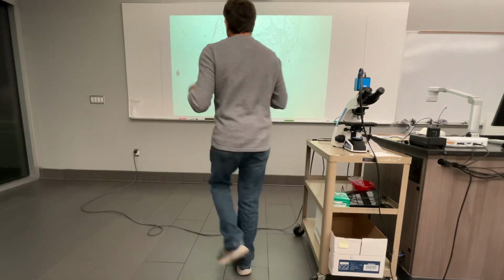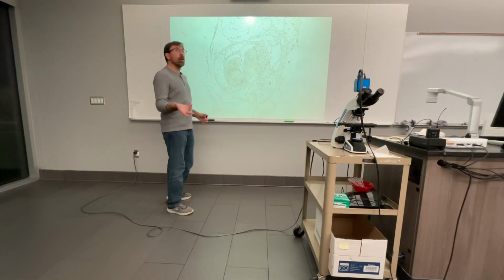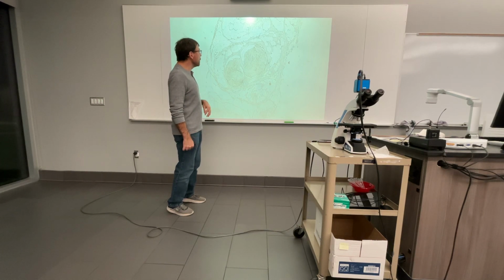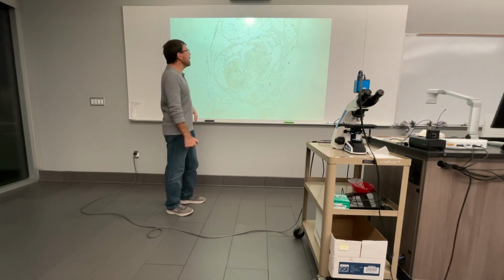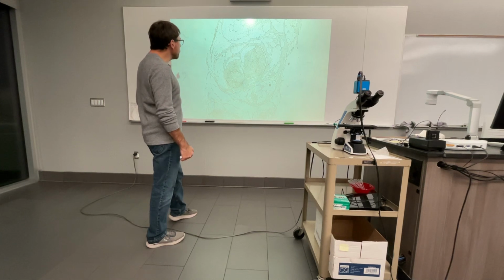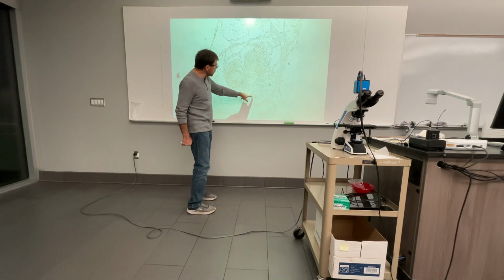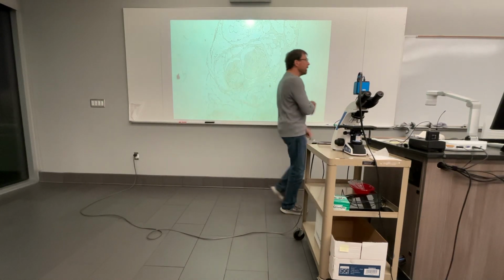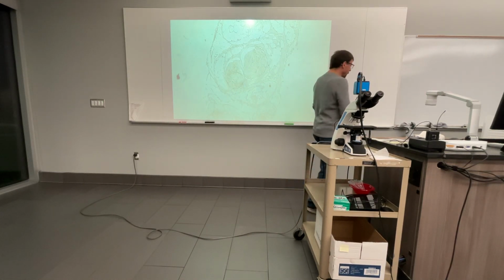So, first of all, this is a nerve. Okay, it's a cross-section of the nerve. And so that means there's going to be many nerve fibers in here. And the nerve fibers are referring to each one of these individual units that we see here. Now, since it is a nerve, you know they're myelinated.